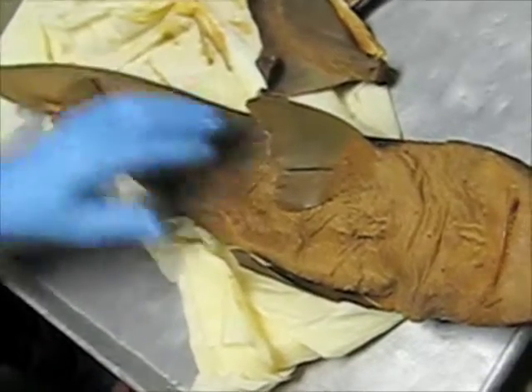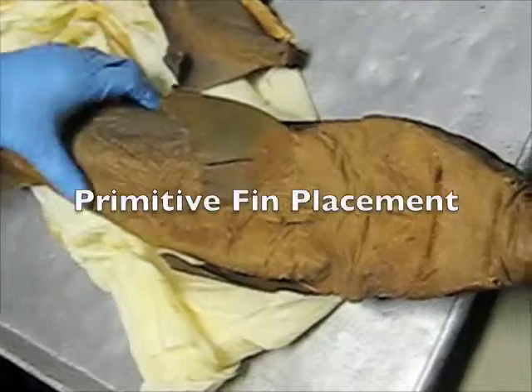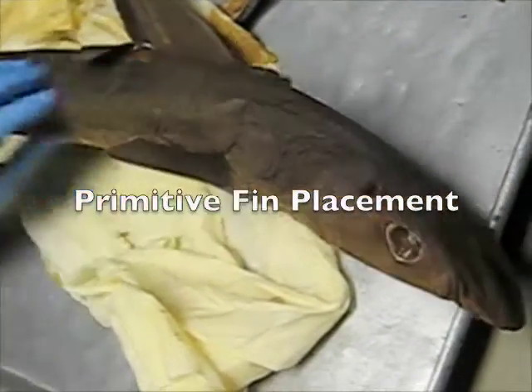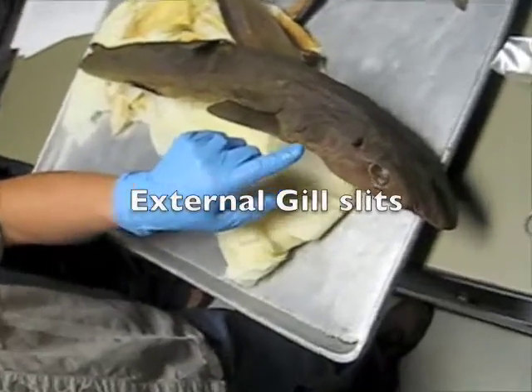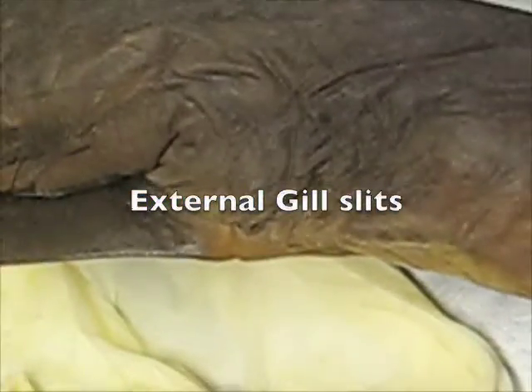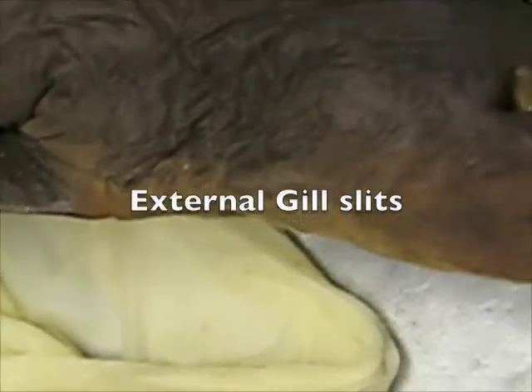One of the things that you'll notice is that the fin placement is what's referred to as the primitive position. They're down low on the body. So notice that the pectoral fins are down very low. Notice that the pelvic fins are down low. You can see the external gill slits right here. All right, so all of these cartilaginous fish are going to have these external gill slits.